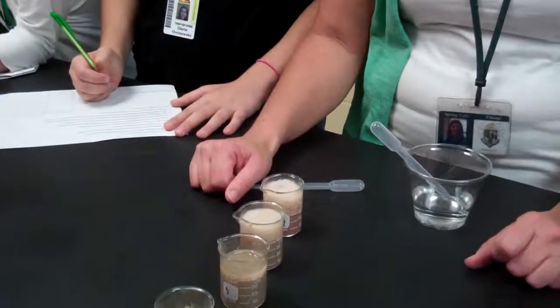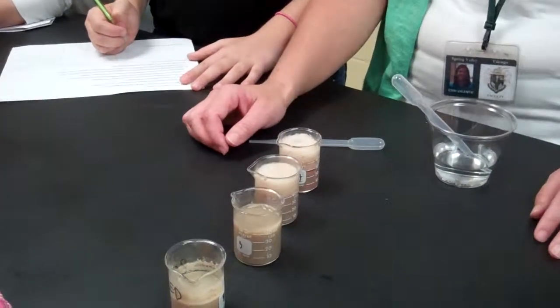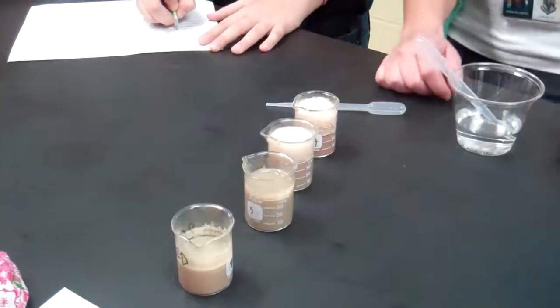Okay, one more question. What are the bubbles? Oxygen coming to the surface. Oxygen, right? So when you add hydrogen peroxide, which is H2O2, to the liver, what are your two products that you're going to get? Water and oxygen.